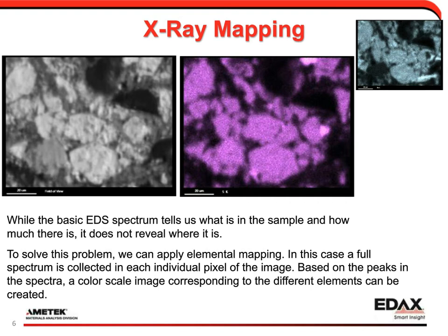There's a sulfur-containing, quite large particle in your lower left-hand side corner, which corresponds to a slightly darker particle in the backscatter image, where we can see, if we compare to the barium map, there's no barium found in that particle. And we can also see we have a high sulfur-containing particle around the middle of the image to your right-hand side.